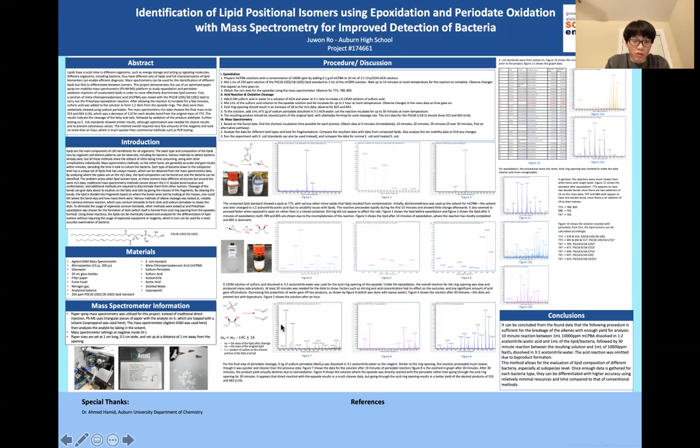So the first one here, I believe, is the periodate solution that was reacted with the diol. So figure 7 here. I did get the desired products, but there were too many byproducts, which further motivated me into omitting the acid reaction step.